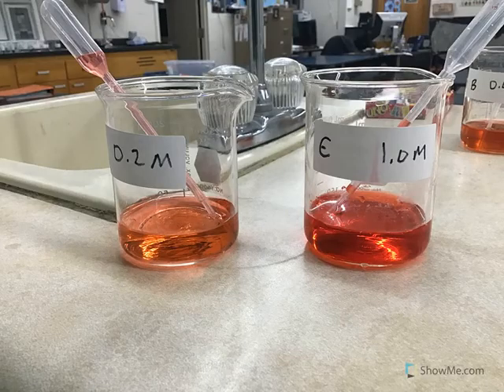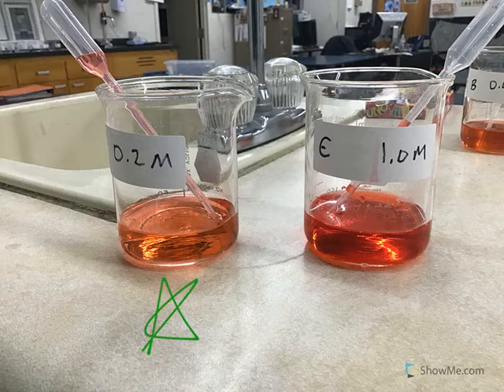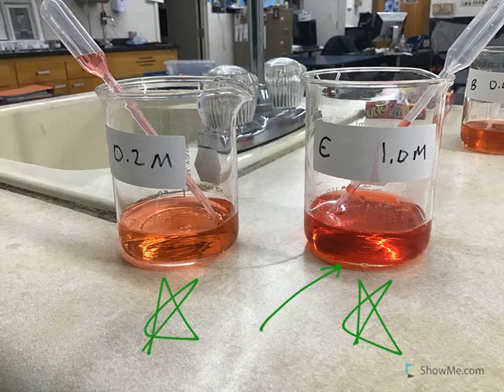So let's look at an example. On the left we have a 0.2 molar solution, which is a light red. And on the right we have one that's 5 times as concentrated. It's a 1.0 molar solution. And you can tell just by looking that the 1.0 molar solution is a darker, deeper red than the 0.2 molar solution. If we were to shine light through this 1.0 molar solution, since it's more concentrated and the solution is darker, it would absorb more light, allowing less to pass through.